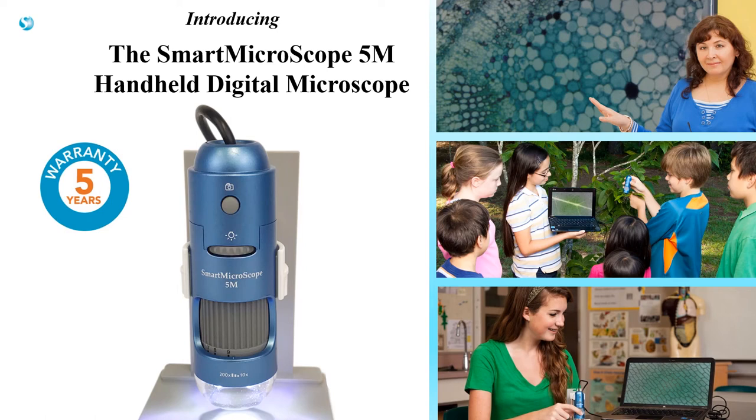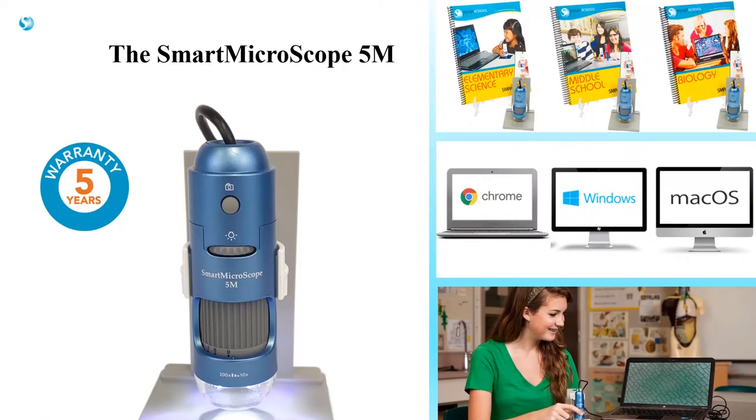Introducing the Smart Microscope 5M Handheld Digital Microscope. The 5M is unlike any other microscope — it was built for the classroom. It is durable, easy to use, and comes with teaching materials.